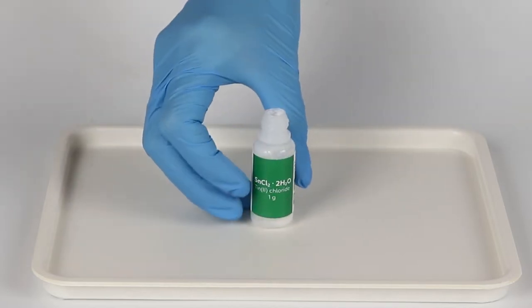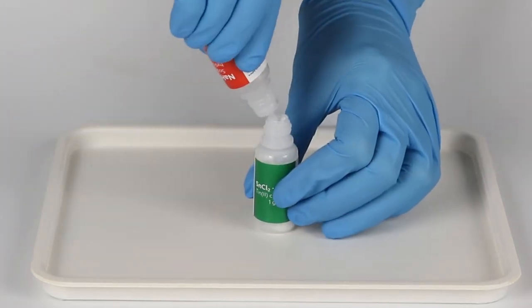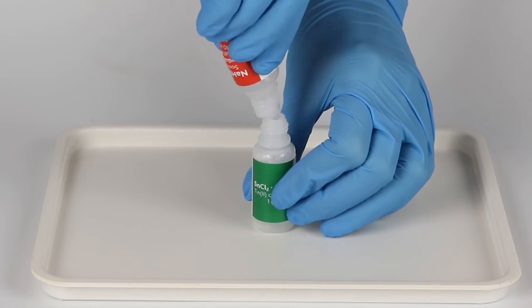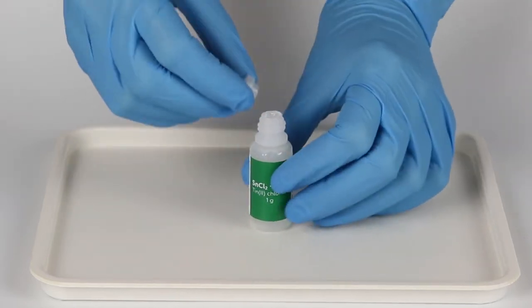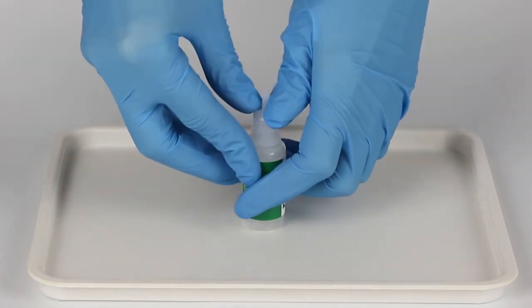Open the bottle of Tin Chloride and pour one bottle of Sodium Hydrogen Sulfate Solution into it. Securely insert the tip and close the bottle using the red cap.